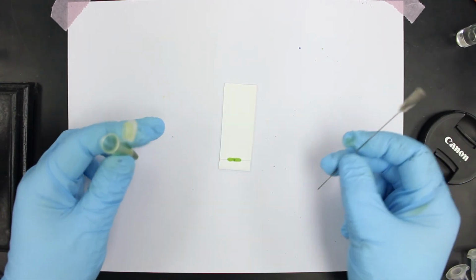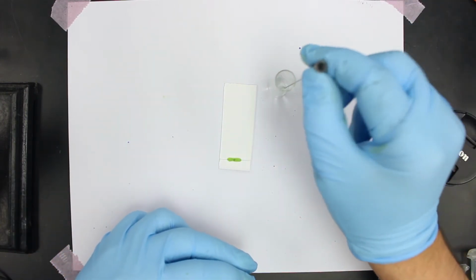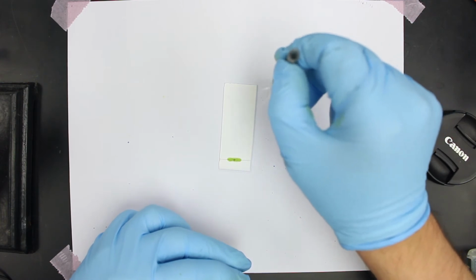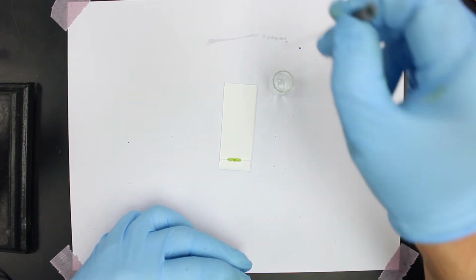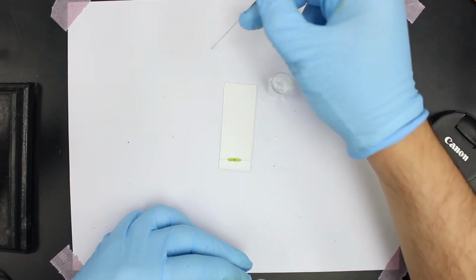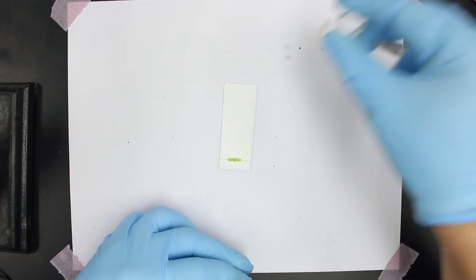Okay, so now that I've applied my sample, what I want to do first is clean this, because I'm going to reuse it. So I'll dip it into some acetone to clean it, and I'll just deposit it onto a paper towel that I have on the side. In fact, you can just do it on this paper here too. Just rinse it out, make sure there's no residue, so the next time we use it, we don't contaminate the next sample. Do that a couple of times. Okay. We'll place that off to the side.